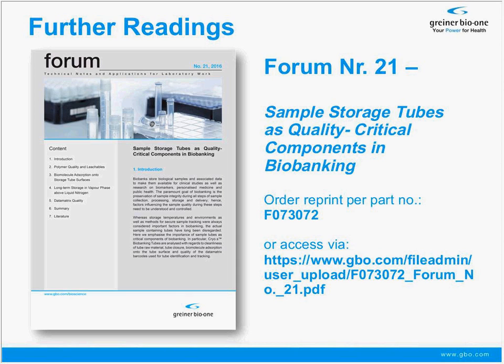It's our forum white paper number 21. In this document, you find all the experiments we have talked about, but you also find many more details about the raw data we had, about procedures, how we have tested everything, and there are also additional tests detailed and provided in this document.